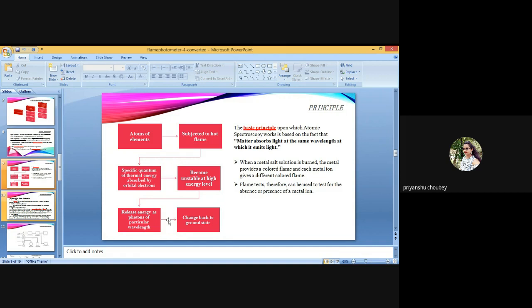Precautions: filter soil extract and plant digest with Whatman number 42 filter paper to prevent clogging of the nebulizer. Use a salt nebulizer, or standards and samples having very low salt content, to prevent clogging of the nebulizer tip. Avoid mixing of chemicals that cause precipitation during the preparation of multi-element working standard solutions.